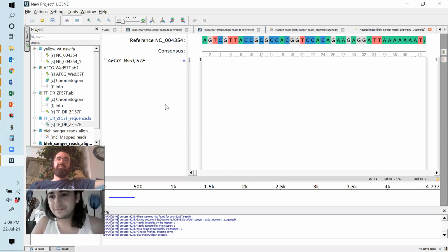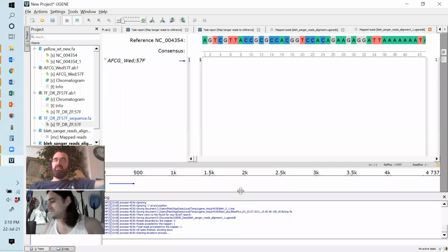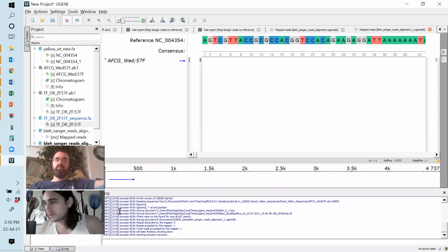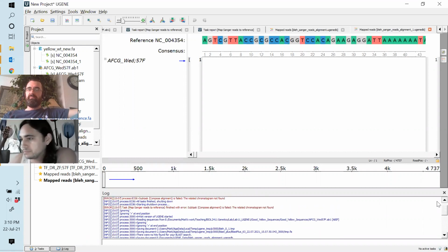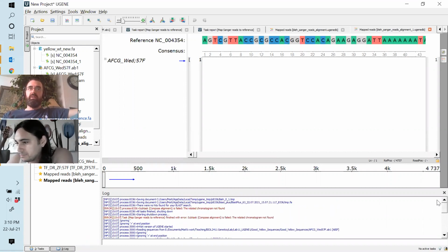Okay. So, Dipper, can you see down at the bottom, there's a little process box. And you can see the thing that is causing problems with mine: more than one sequence in reference file. Okay, so take me through exactly what you're doing. And you can unmute as well. It may or may not make life easier.